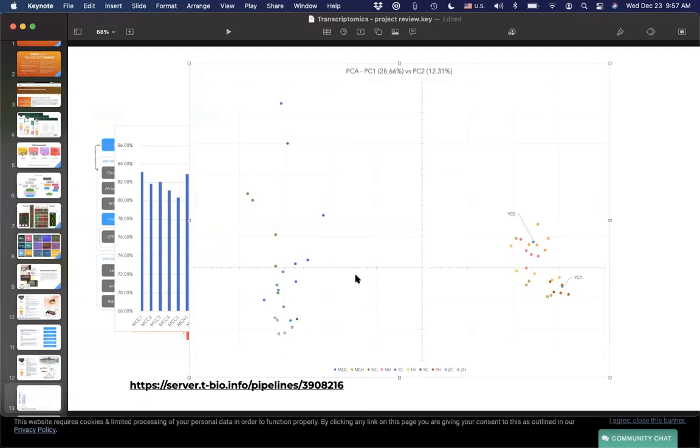The other thing is that I am not sure whether this was done before or after normalization, but as you know, in PCA, you can do scaling, you can do normalization, you can do normalization per group, right? So there are many different things that you can do to try and work with just your exploratory data analysis step.